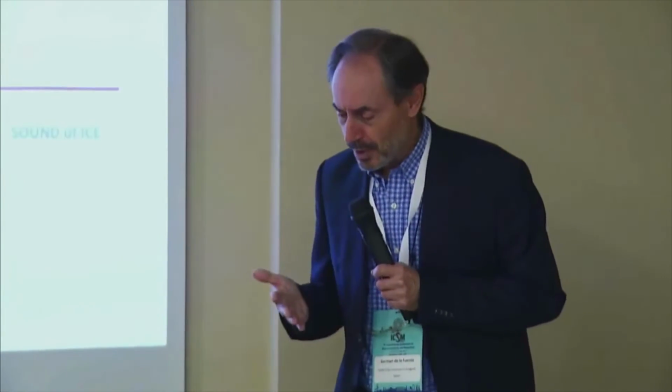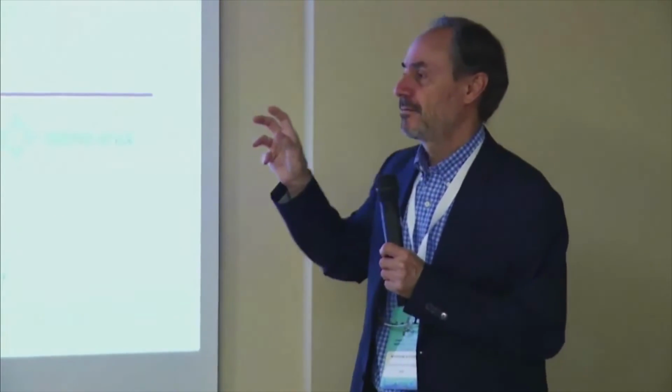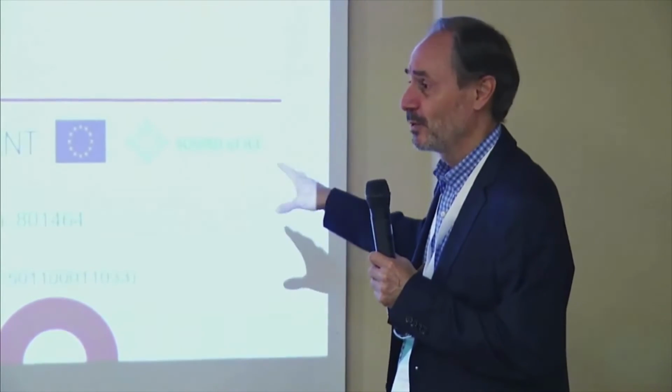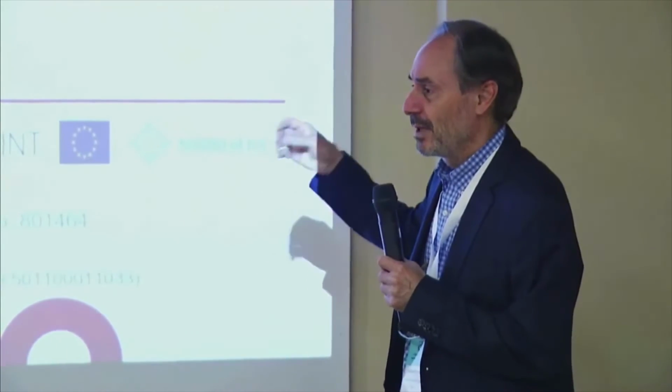In this superconductor processing, what we try is to control the microstructure and elongate the grains, with a very high level of anisotropy. And we do this at speeds of about 30 millimeters per hour. And here we are at 1500. So this difference goes towards a lack of crystallinity. But surprisingly, in this system, we still have a crystalline result, so that the surface is still nickel ferrite spinel. But it's surprising to us.